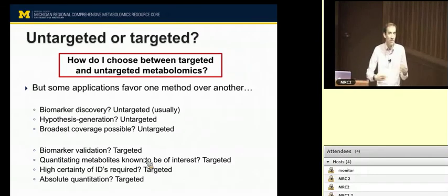So we would never suggest that you collect a single sample, a single plasma sample in your control in an experiment, and try to get data out of that. That just won't work. You know that already. So biological replicates can often give you that information about reproducibility on a biological scale, encompassing the analytical reproducibility, and technical replicates of a pooled sample will give you the rest to say how good the technique was doing.